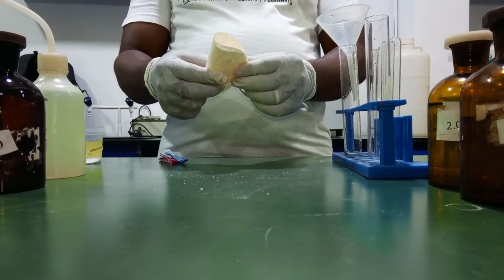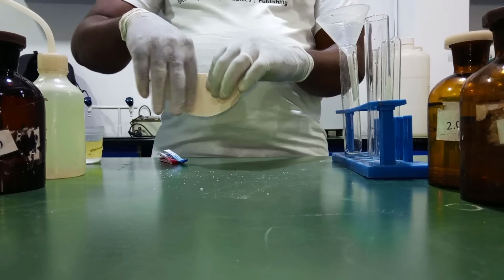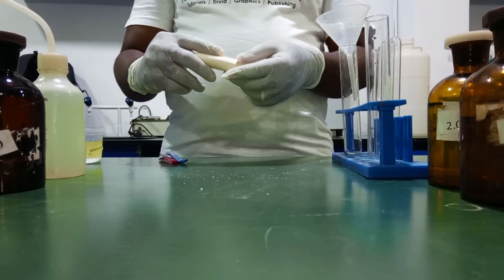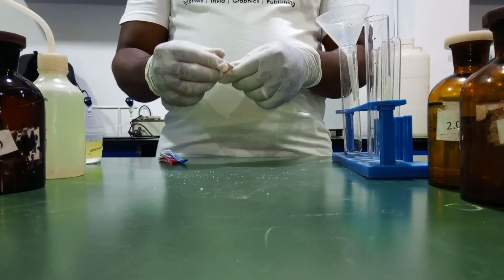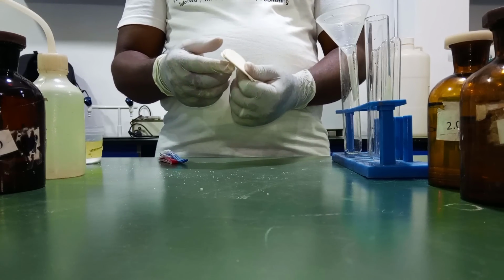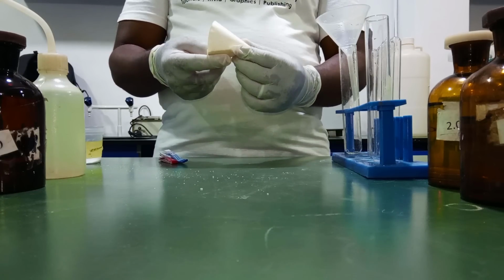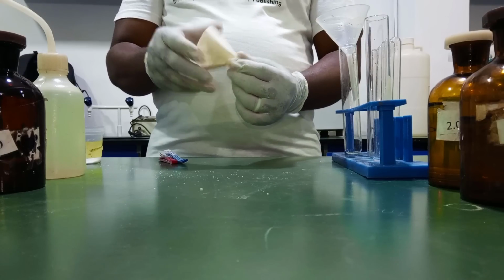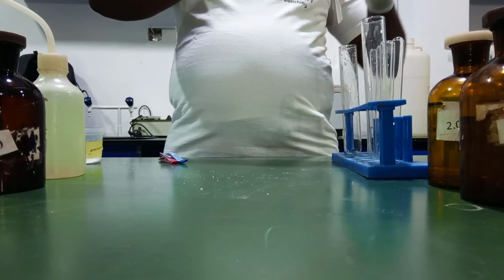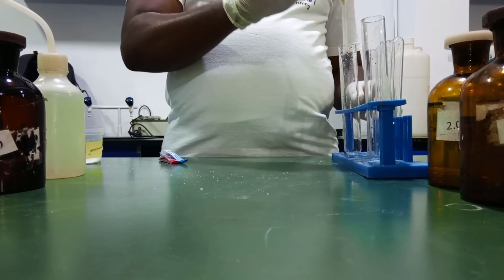First of all, you fold it into a half, and then into a quadrant, and then open it up as a cone. Then place it on your filter funnel, right?